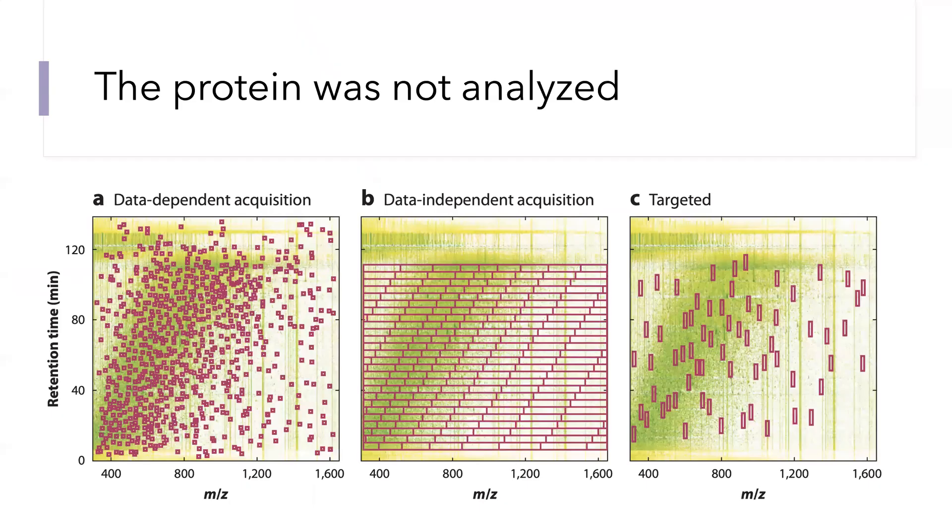The first and very common mechanism for missing values is when a protein or its peptides are not analyzed. The data were never acquired, and this happens with different types of data acquisition as illustrated with data dependent acquisition, data independent acquisition, and targeted acquisition.